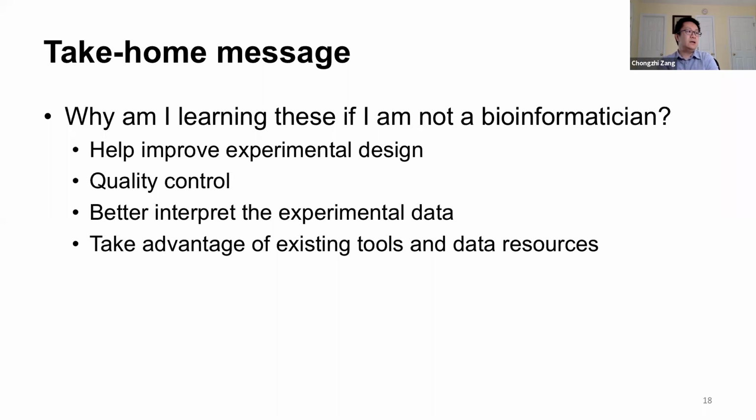Even if we are not doing data analysis on a daily basis, learning some ideas or strategies for ChIP-seq data analysis, as well as analysis of any genomic data, will help you understand how the data were analyzed and how the data were generated. They may help you improve the experimental design.